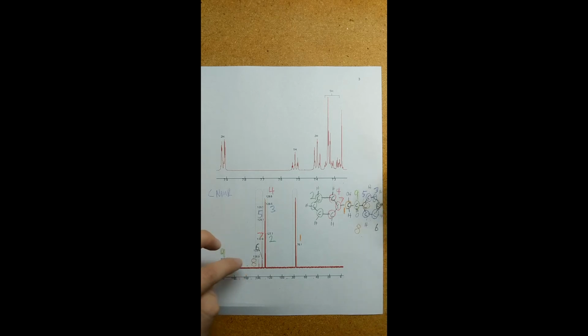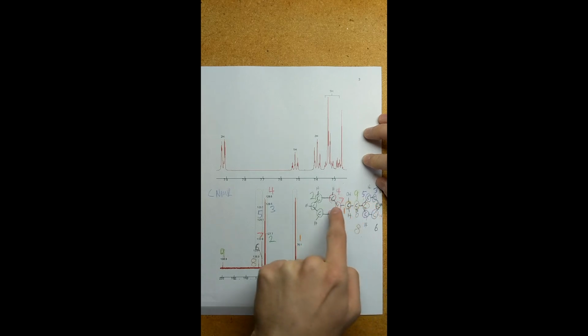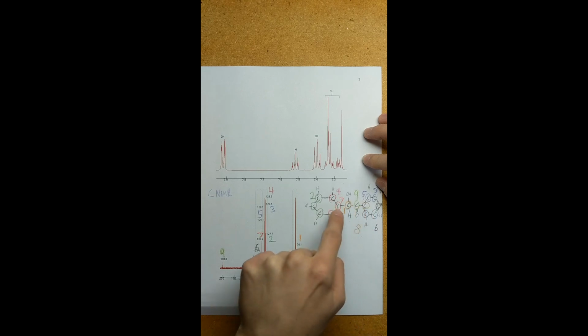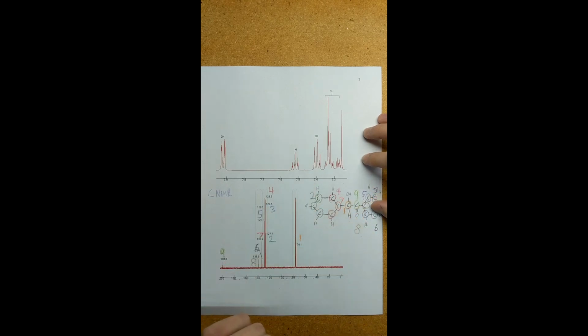Moving on to number 8, this has a little bit more of a jump to be more deshielded at 138.9. This makes sense because we flip from this ring structure to this ring structure on this inside carbon, and this is much closer than this one. Number 8 is much closer than number 7 to this double bonded oxygen, making it more deshielded, pushing it more downfield.